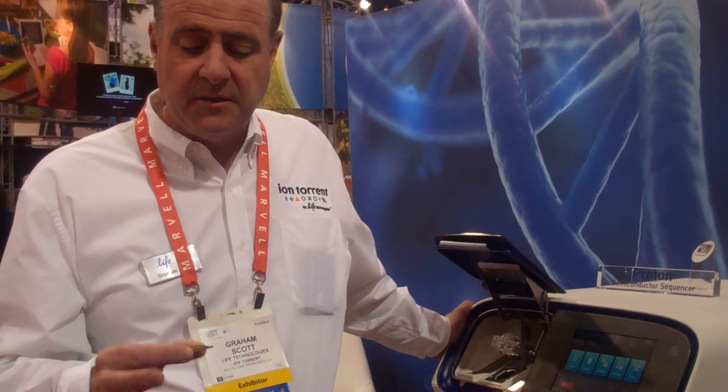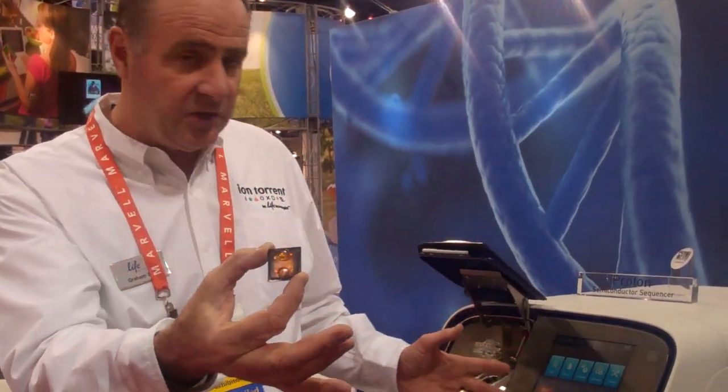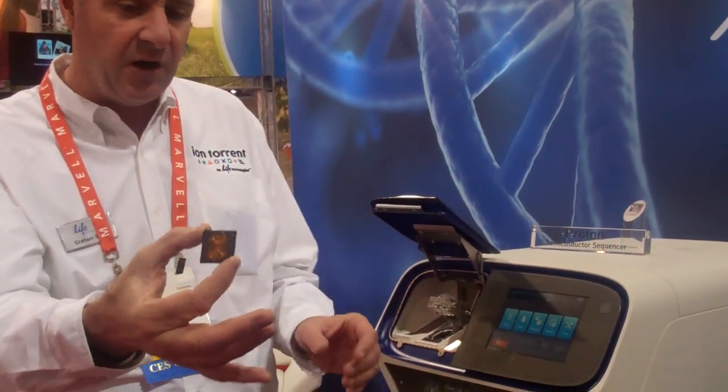My name's Graham Scott. This is the new Proton Sequencer holding the chip — the Proton 1 chip — in my hand, and here you can see the Proton Sequencer itself.